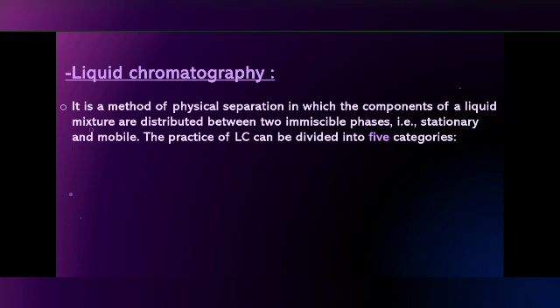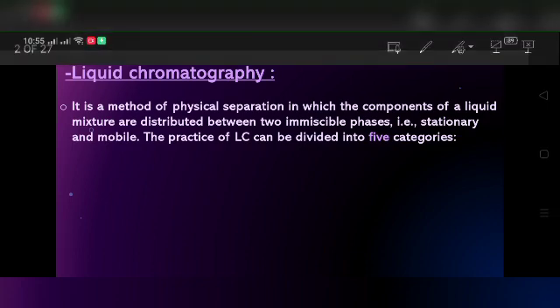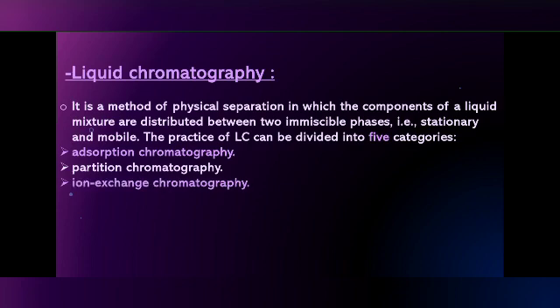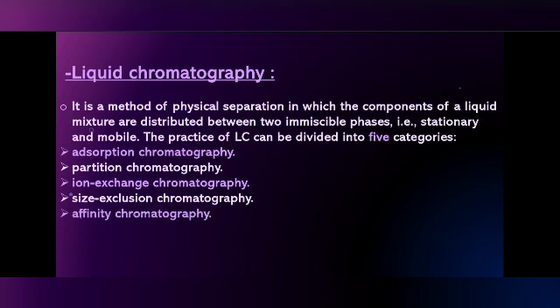The practice of LC can be divided into five categories: adsorption chromatography, partition chromatography, ion exchange chromatography, size exclusion chromatography, and affinity chromatography.